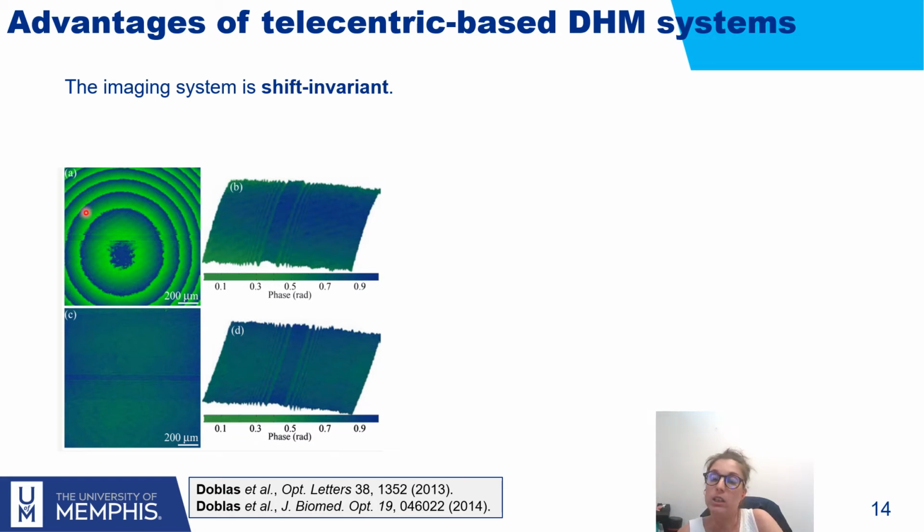And you can say, fine, I have a quadratic phase factor here, but let's try to remove it. So let's say that you want to have a single shot technique, right? So you just need to compensate for that quadratic phase factor. One way to compensate it is to estimate the center. So you know the center of the quadratic phase factor is here, and then by making profiles and fitting, you can know the curvature along the x and y axes, and you create a synthetic, digital conjugated spherical phase factor to compensate.